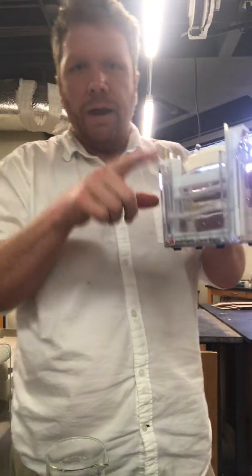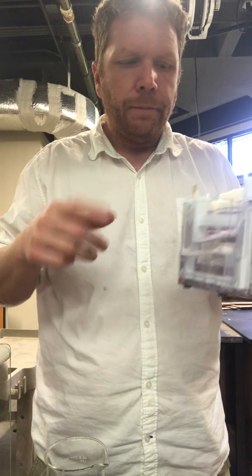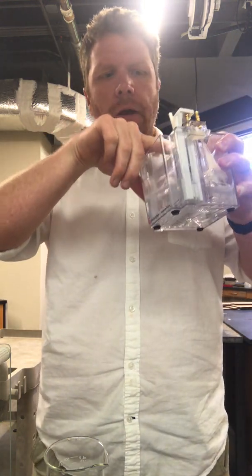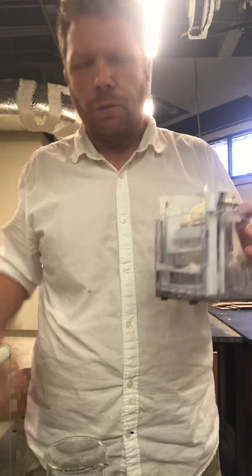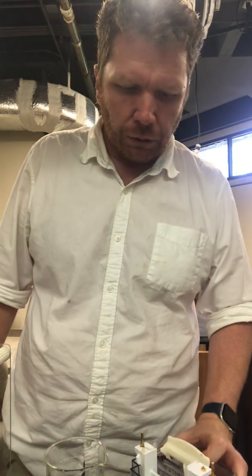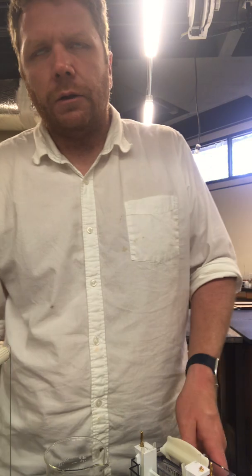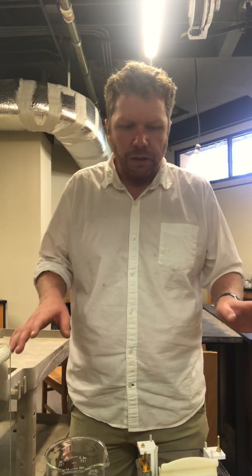Now what some folks will do is they'll just fill this all the way. They will put so much running buffer in that the central gasket overflows. I prefer not to do that. I don't really encounter problems with that, but to me, it's unnecessary. Okay, so I've got this all set up.